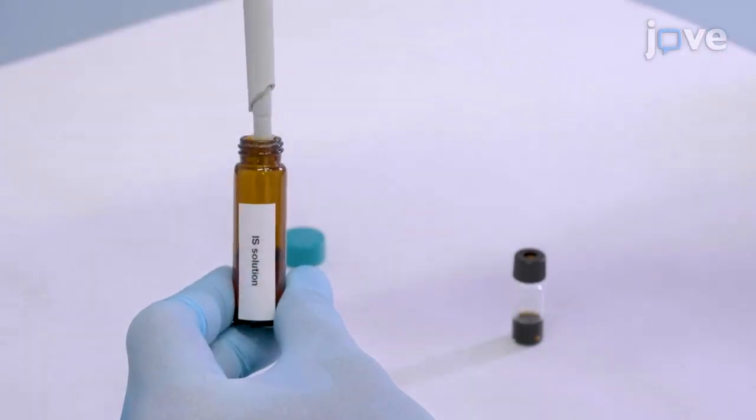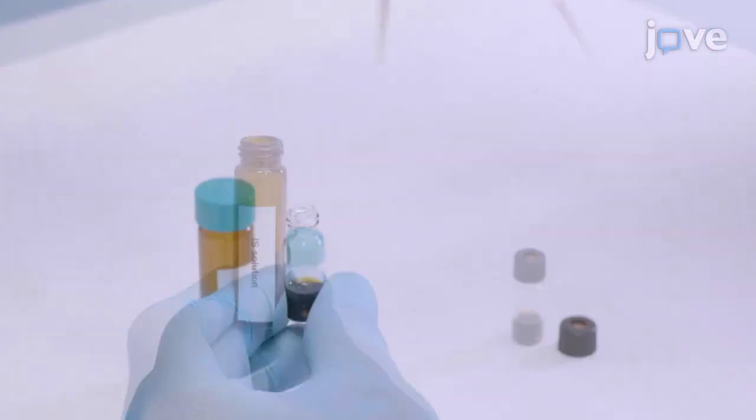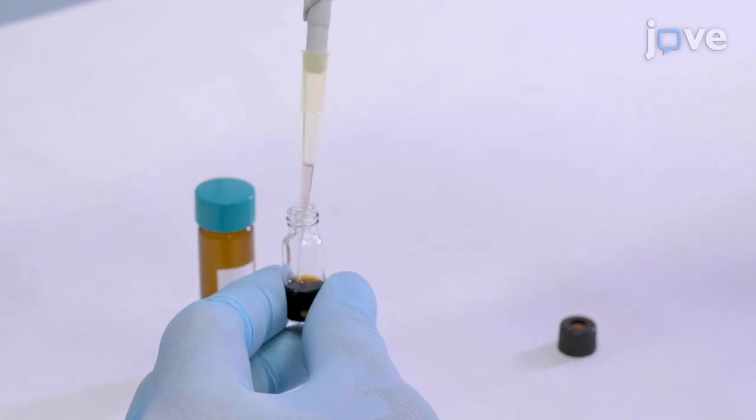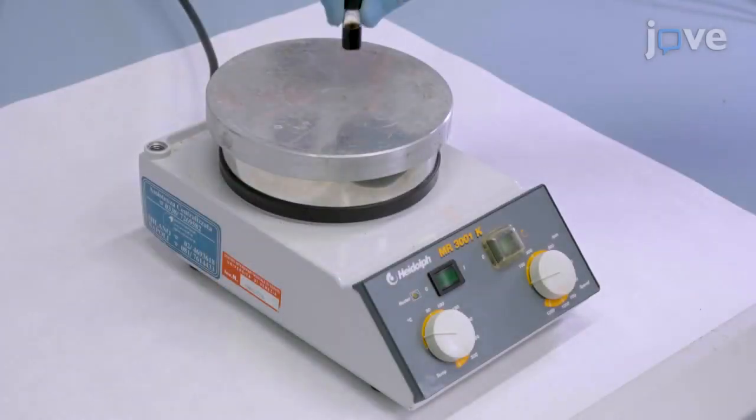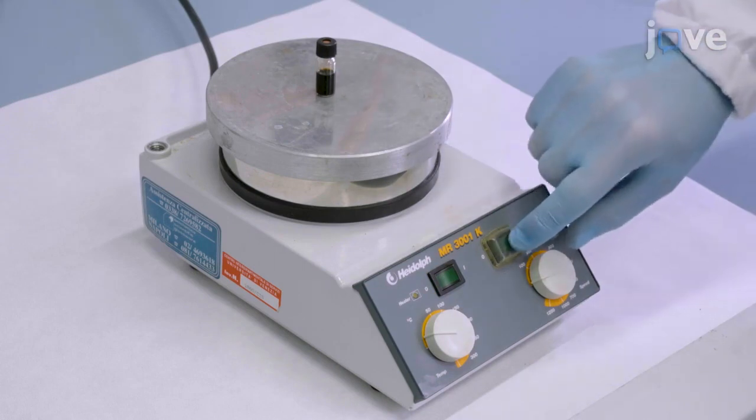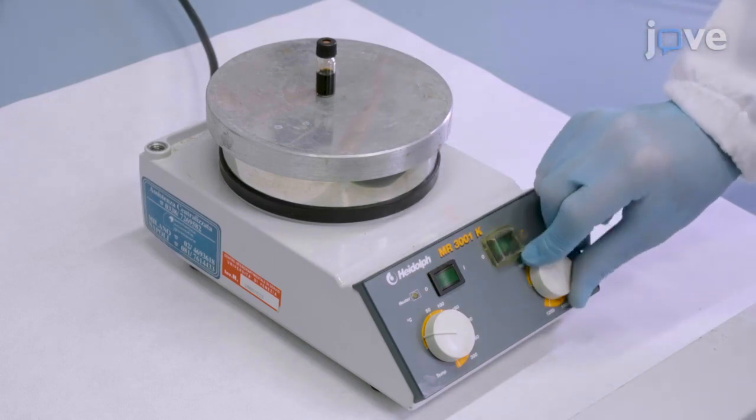Using a micropipet, add 100 uL of the internal standard solution to the sample vial. Then magnetically stir the resulting dispersion at 500 rotations per minute.